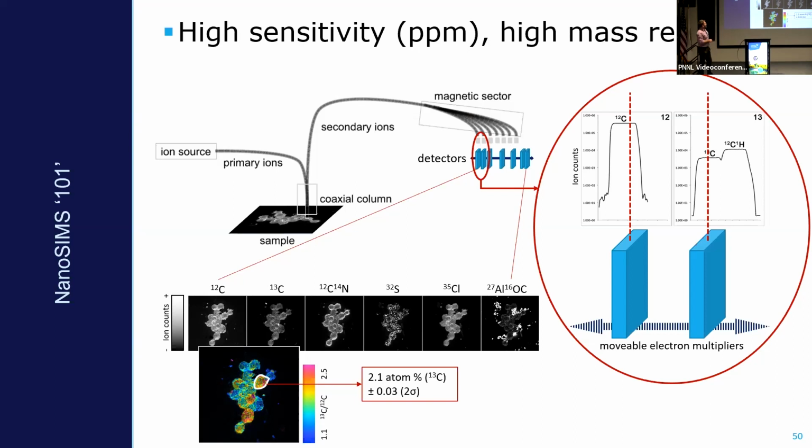We would run a scan to find out the exact radius of the magnet where we want to be. In this case here, we want to be about here. So we would physically move this detector, on really train tracks on a small scale. And that's where that detector is going to collect those 12C. It's a little trickier for 13C.